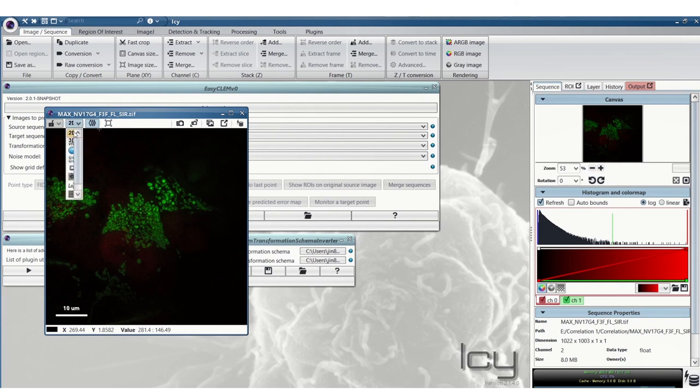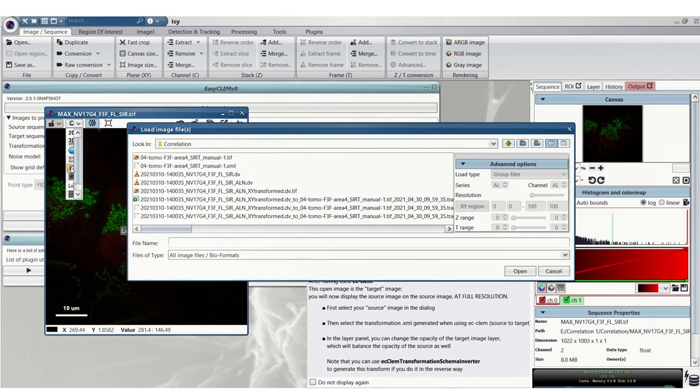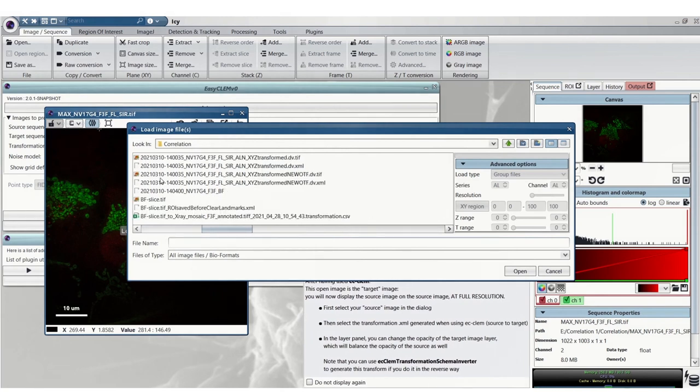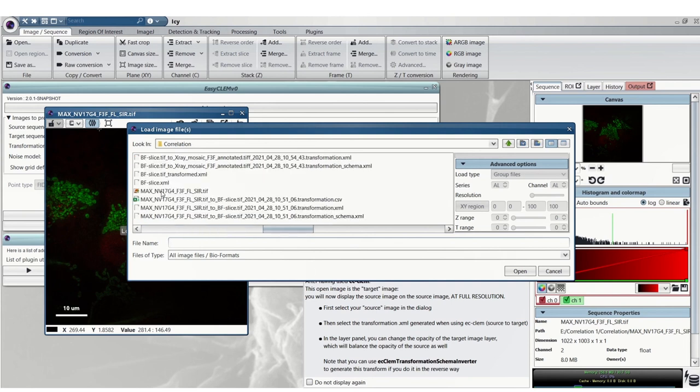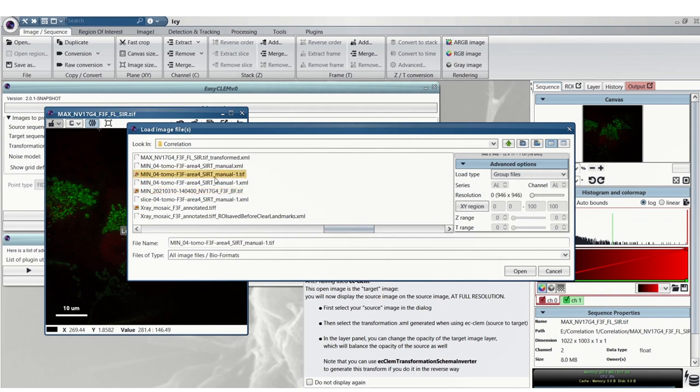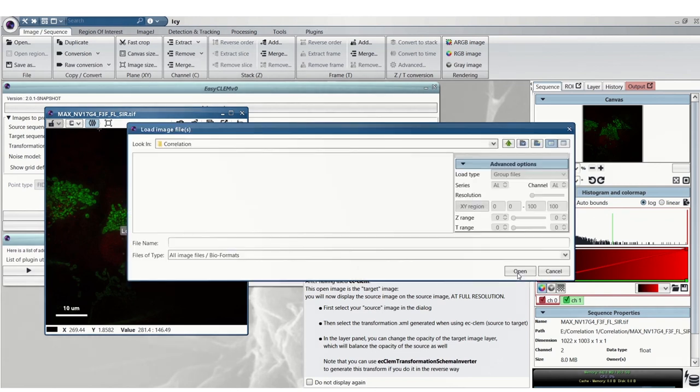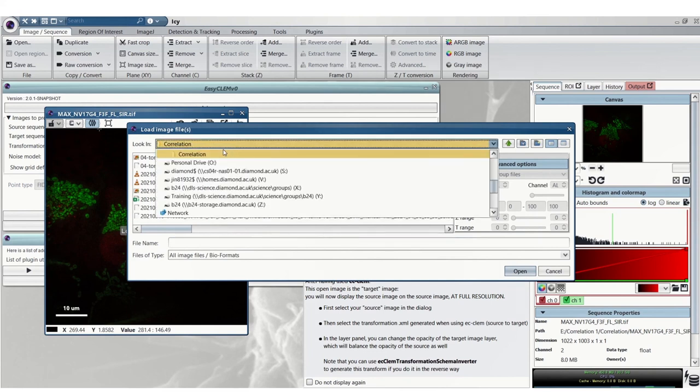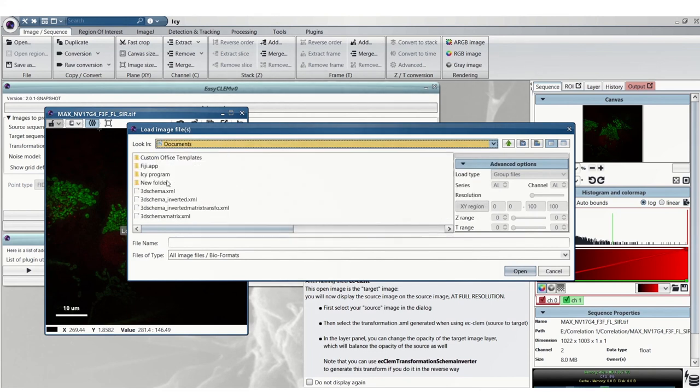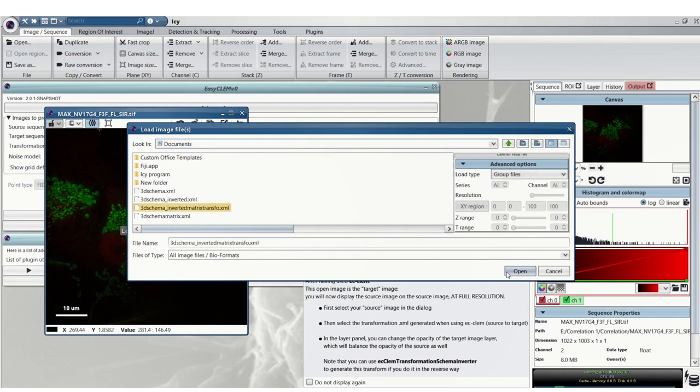Now we'll go onto this drop down bar here and go to the correlative view plugin which you can find instructions of how to install that on the eC-CLEM website or in the Star Protocols paper. Firstly we'll choose the maximum intensity tomogram. In the next pop-up box we'll choose the new inverted schema that we've just created with the underscore matrix transfo.